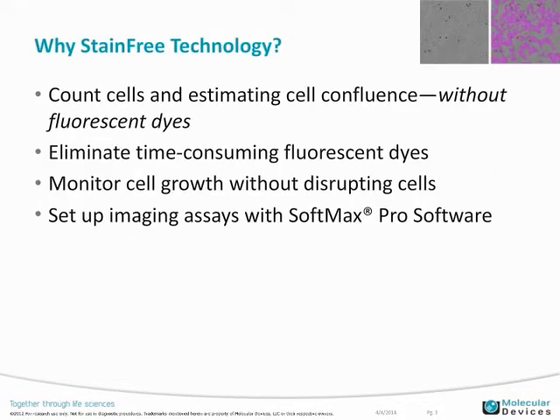StainFree Technology is Molecular Devices' patent-pending algorithm for counting cells and estimating confluence without the use of fluorescent dyes. It's available on the SpectraMax i3 plate reader with the MiniMax imaging cytometer. So it helps users to eliminate time-consuming fluorescent dyes and to be able to monitor cell growth without actually disrupting the cells, and also to set up imaging assays all within the SoftMax Pro software.